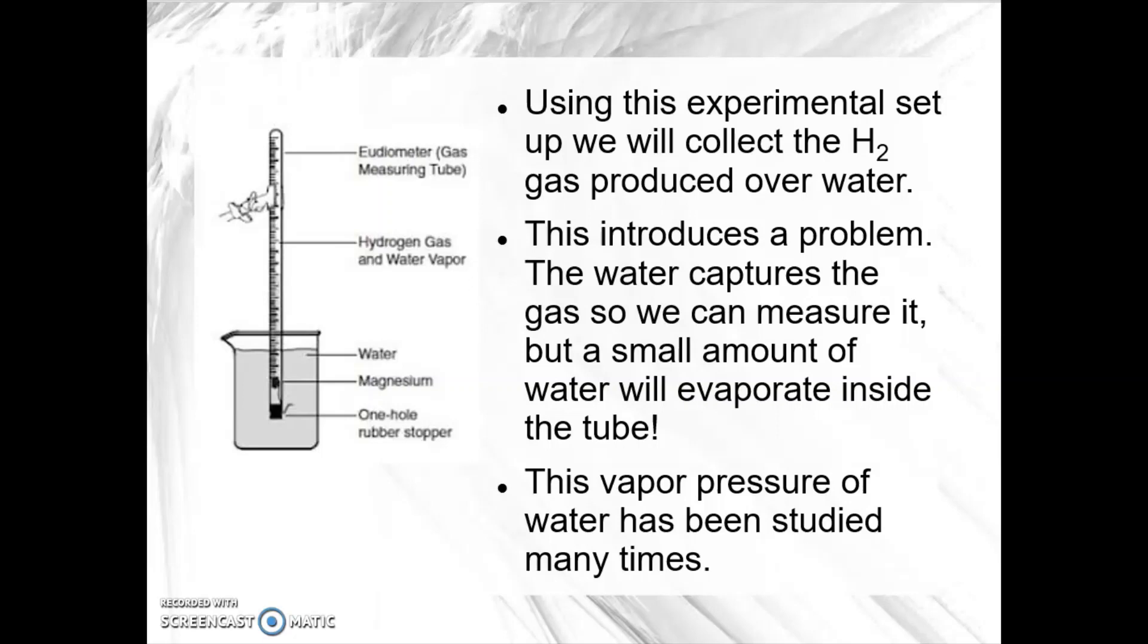Now you've seen our experimental setup, and you can see that it looks essentially just like the picture here. We have the eudiometer, which is like a long test tube that's graduated, so we can measure the volume. We have the magnesium down in our little cage, the one-hole rubber stopper. We've inverted it into a water bath.